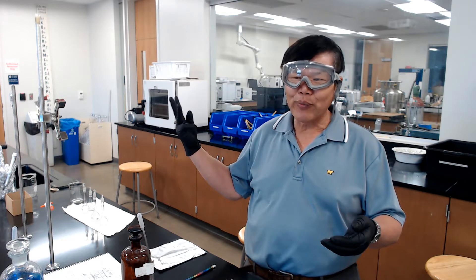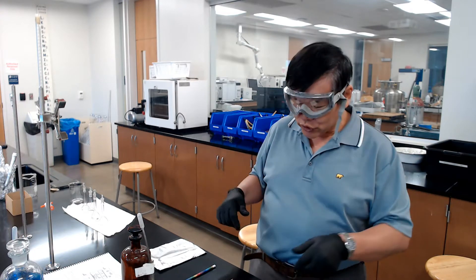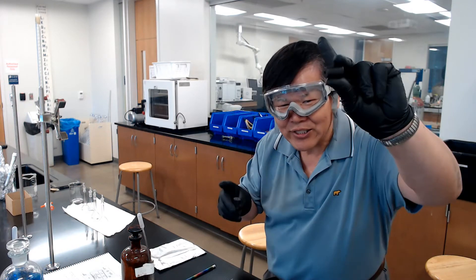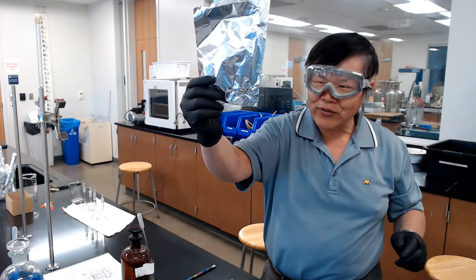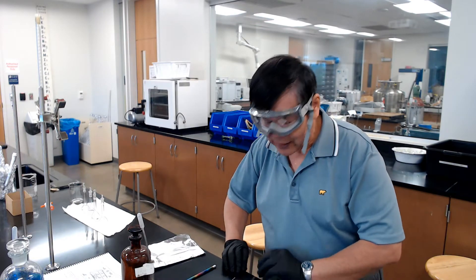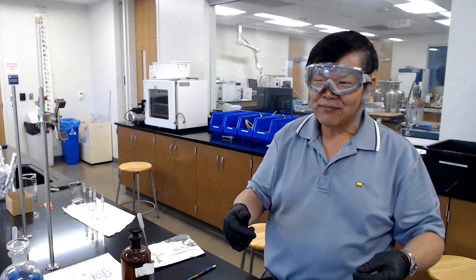For Week 1, gather three test tubes and three stoppers. You also want three pieces of aluminum foil to cover the tubes, because silver acetate solution is photosensitive — it's light sensitive. Then get three strips of copper wire about six to eight inches long; you don't have to be precise about that.